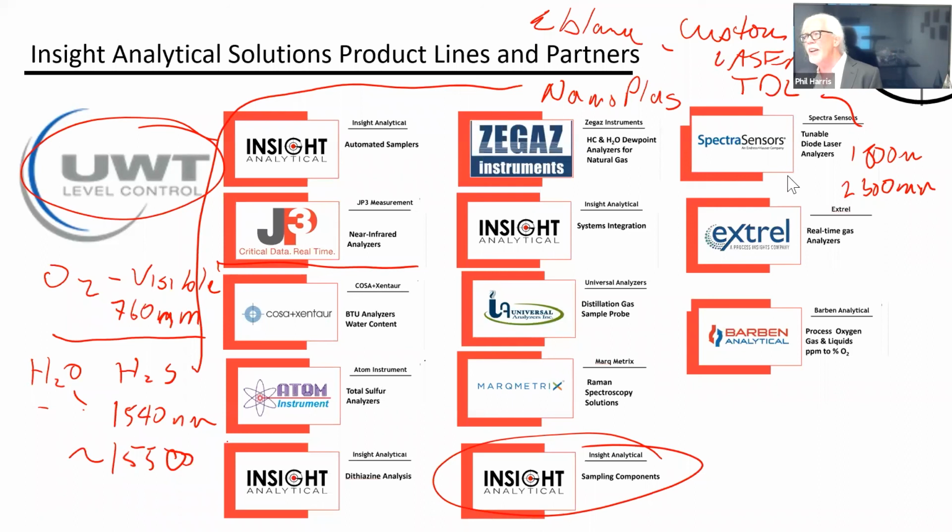No, typically we recommend that you run a zero gas, like run a UHP nitrogen on it, say once a week or so, and look to see whether it's coming right down to zero. The thing to know that the sensor is degrading is usually zero drift. That's the biggest sign that we often see.